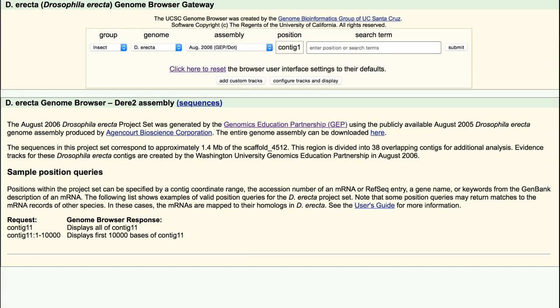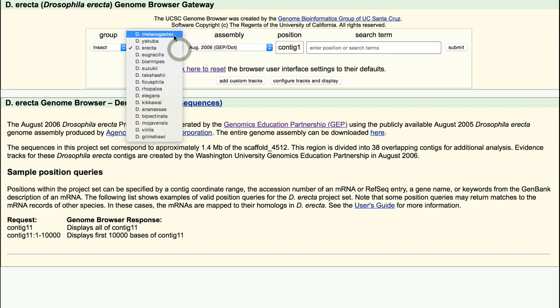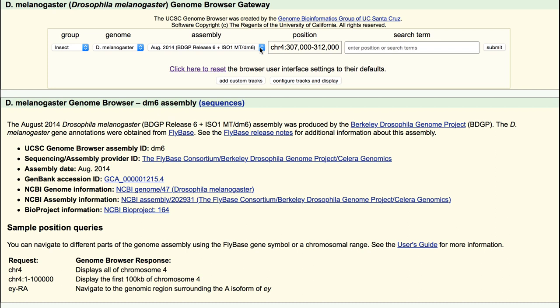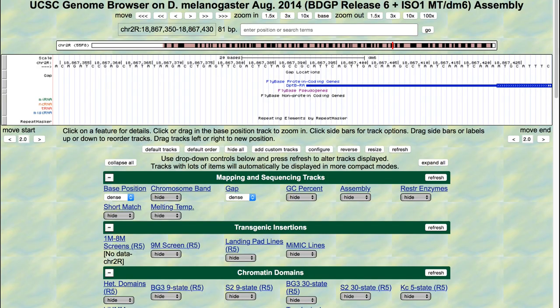Before we get started, go to the Genome Browser Gateway page and select the D. melanogaster genome and the August 2014 BDGP Release 6 plus ISO1MT/DM6 assembly. Enter CHR2R:18,867,350 through 18,867,430 into the search term field and click Submit. This region contains the transcription start site of the Drosophila melanogaster DPTB gene.